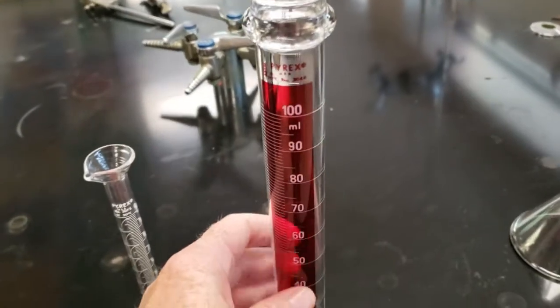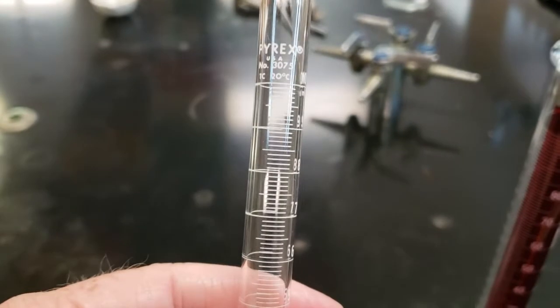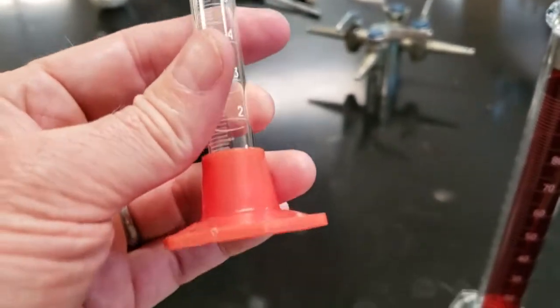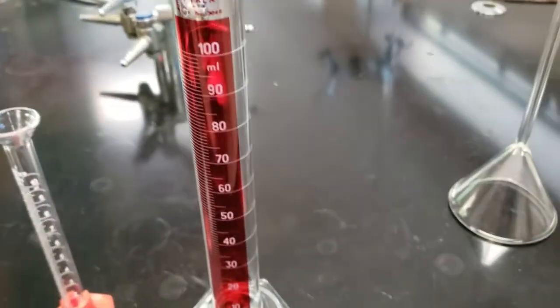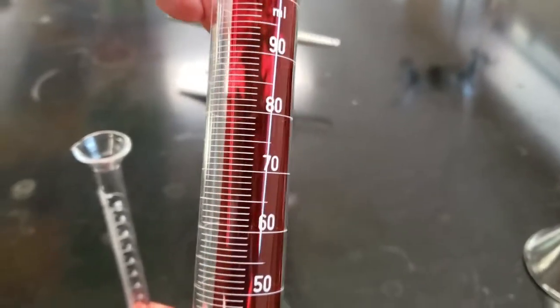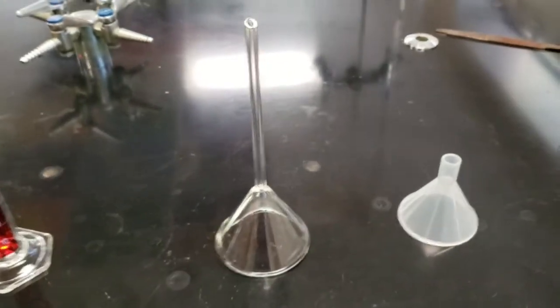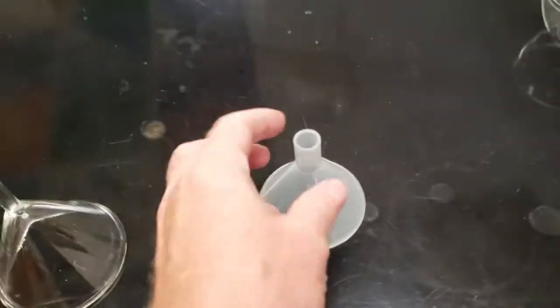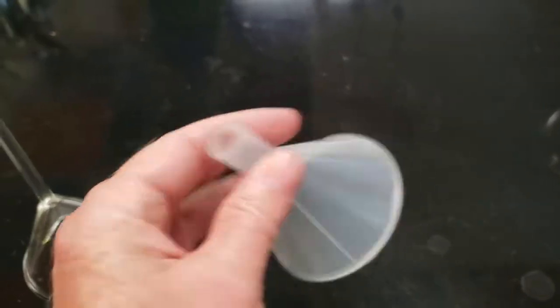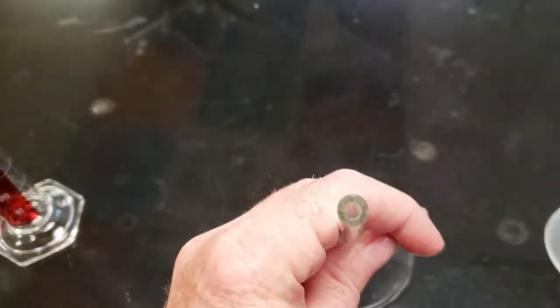These are graduated cylinders. This is a 10 milliliter one, and the one to the right is 100 milliliter. The 10 milliliter is good to the tenth, and the 100 is good to the single or maybe the 0.5. They're graduated because they have multiple lines on them. This one is a glass funnel, and this is a powder funnel. It's a powder funnel because it has a big hole, not because it's plastic. And with the glass one, you can see if you put a powder in there, it'd probably get stuck.